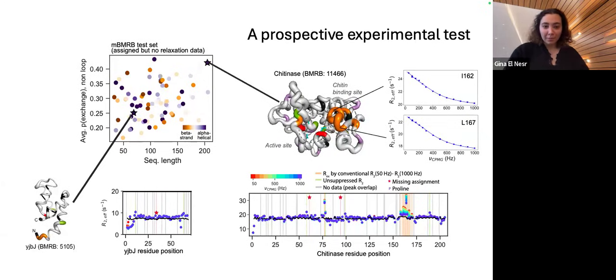Protein, it was one of the standards. So he was 2 years into it, and parts of the protocol have still not changed. The challenge with microseconds to milliseconds is that you can't easily do an HD exchange experiment by mass spec. Now, NMR spectroscopy has great ways of doing it. It's deuterium hydrogen exchange; you look to see whether the proton exchanges.